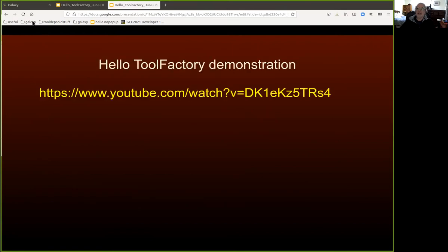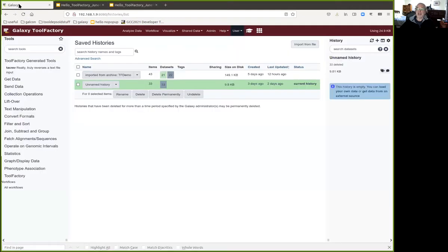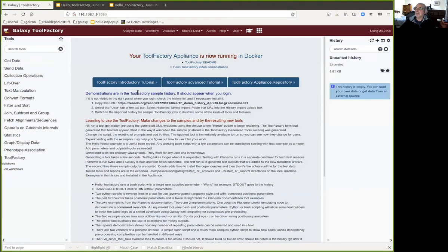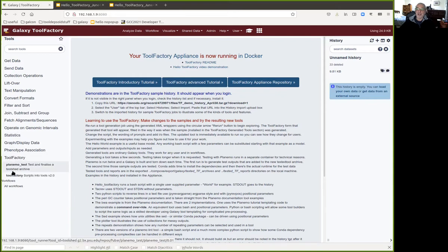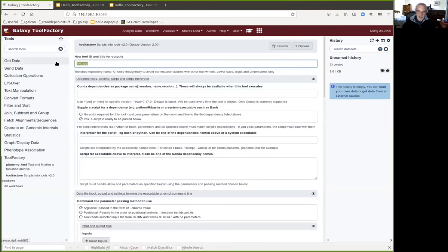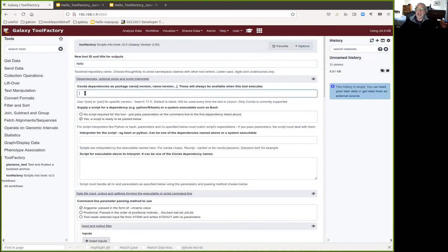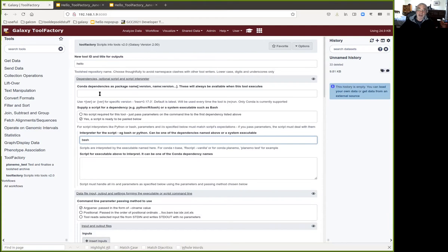Let me run you through a quick demo. I'm in the Tool Factory appliance — all detailed in the introductory tutorial in the GTN so you can get your own. I'm going to fire up the Tool Factory and walk you through the Hello demo. I'll name the tool 'Hello'. We don't need any Conda dependencies because we're going to use bash, which is pretty much always available. We could use a conda dependency — bash is available as one — if you want to fix the version of bash in your tool.